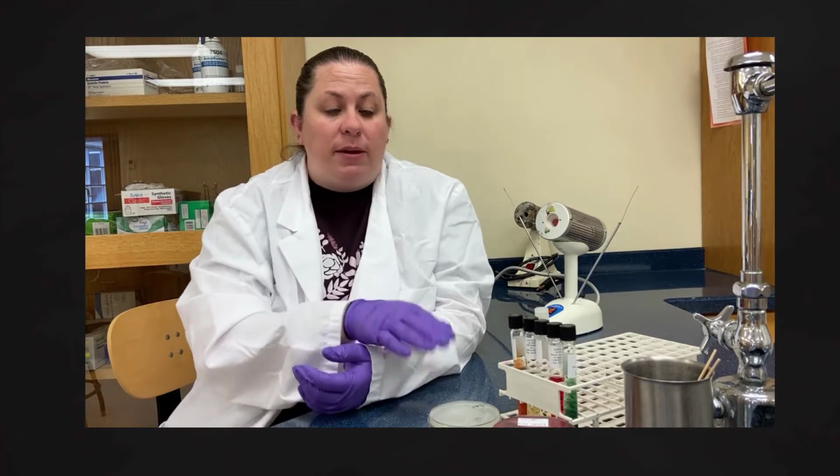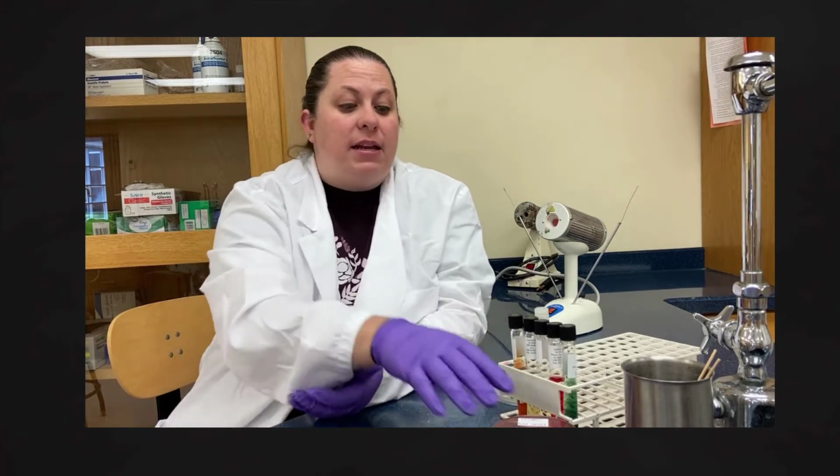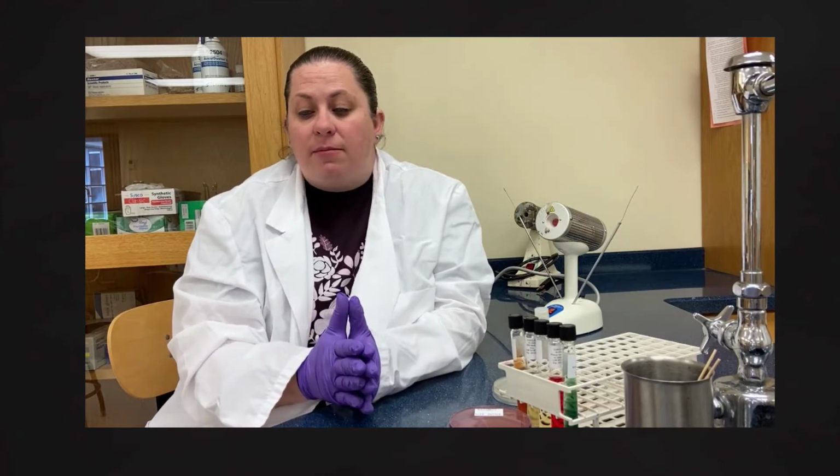All right, so we're going to talk a little bit about media here, culture media, as well as some aseptic techniques on how to inoculate these types of media to where we only have the one bacteria that's present. Now, when we talk about culture media, this is going to be a type of substance that's going to enhance the growth of bacteria by supplying them nutrients.